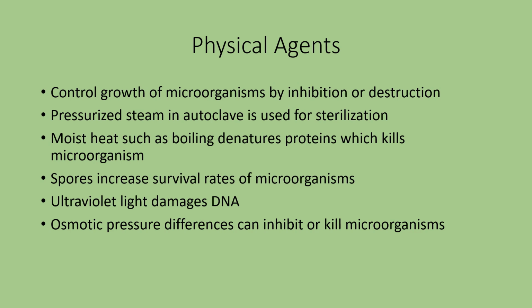In a lab, one of the things we use is an autoclave, and we use this to sterilize. Now, in microbiology, we're very picky about our terms. Sterilization means that you are killing everything in that particular sample, maybe tubes, whatever you're looking at. If you sanitize something, you are just reducing the number of microorganisms that are there. We talk about reducing the load. It just means you're reducing the number, hopefully killing off the pathogenic ones.